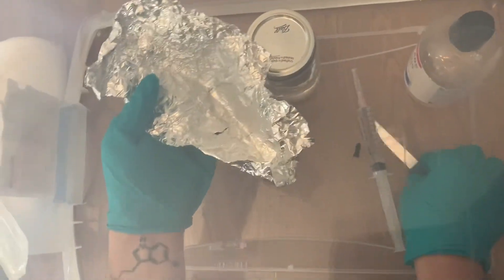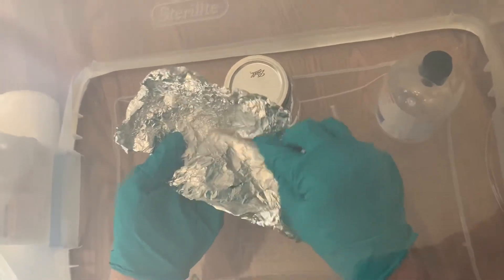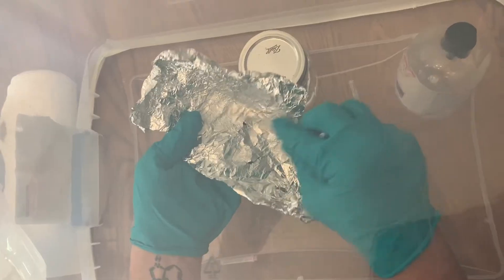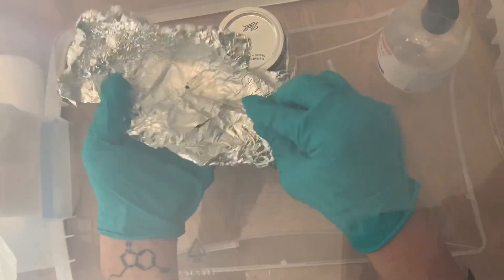So after you wipe everything down with isopropyl alcohol, you want to use your sterile knife to scratch the spore print to release the spores, and then dump them into your shot glass or your small cup.